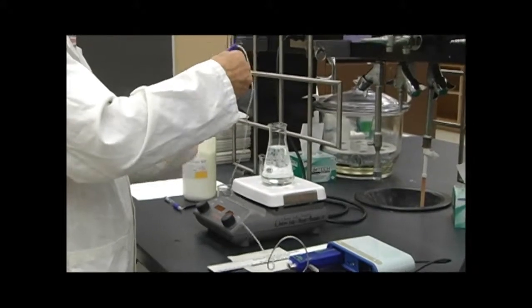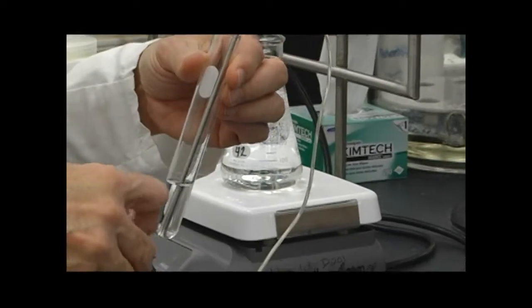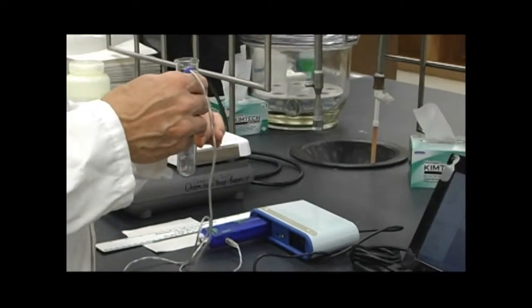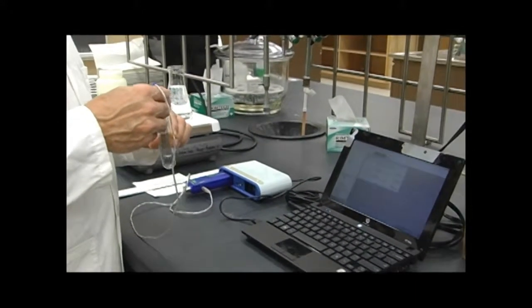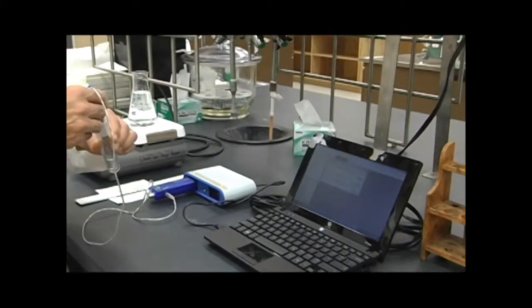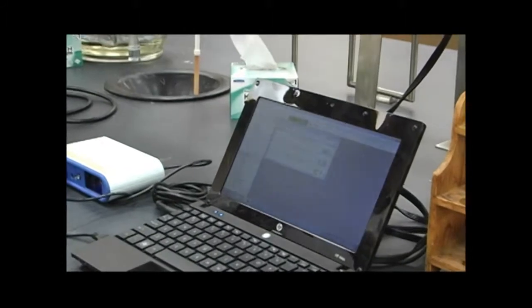There we go. So now it's reached 60, so we'll be able to take it out of the water, and we'll dry the smaller test tube, and we'll put it into the cooling jacket. Okay. And so now I'm going to be stirring it, and the temperature will be coming down. And I'm going to continuously stir this until the temperature stays constant for 3 to 5 minutes. So we're going to be here for a while.